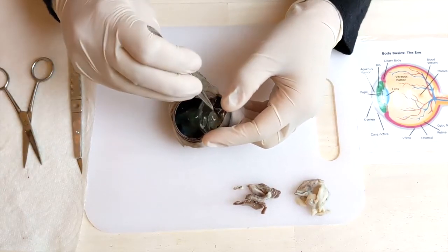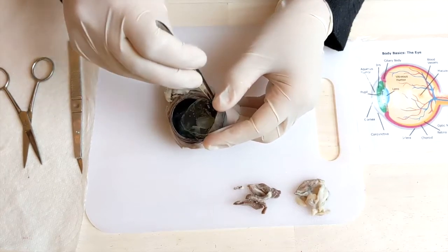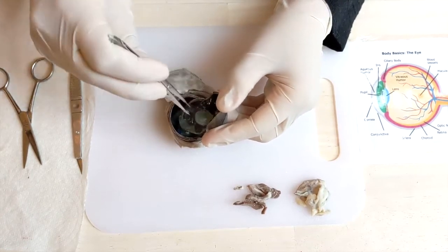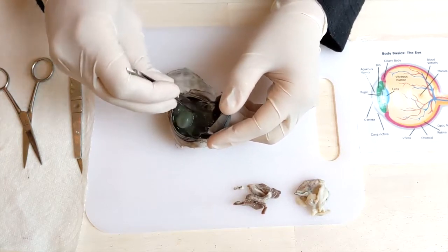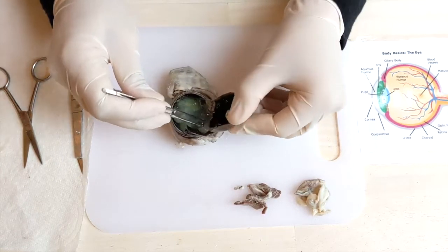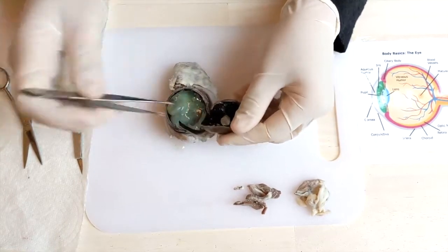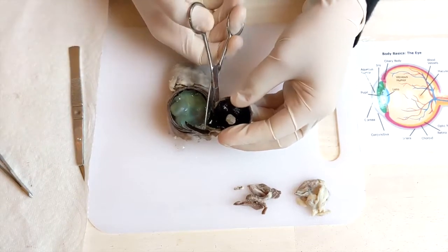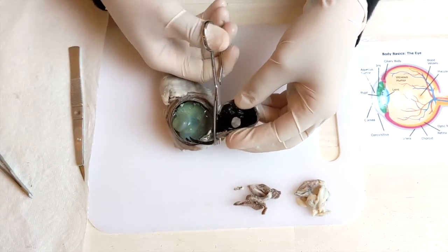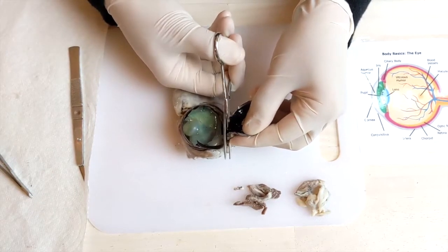So we're going to use our forceps. Can you try to get it without cutting the blood vessels? Put everything inside the eye. Oh, that's right there. So that's the thing when you squish it, it turns green. Oh, by the way, my other son, Abdurrahman, joined the demonstration, just in case you guys are wondering who that second person talking is. Okay, so we'll open this up.